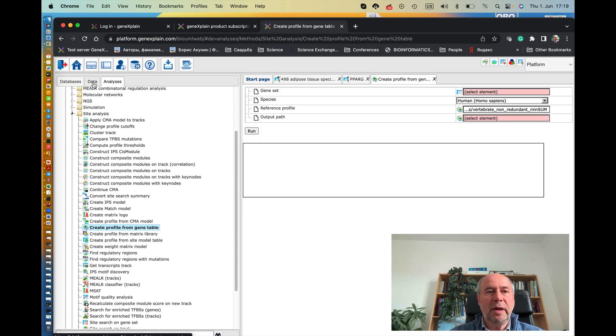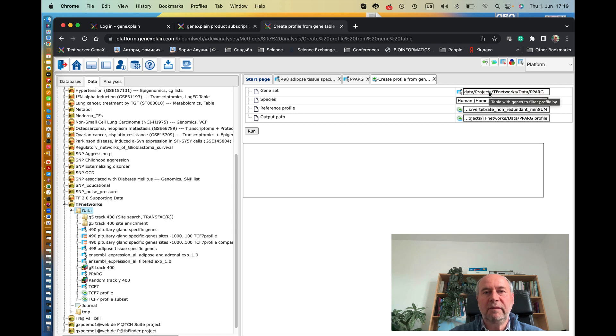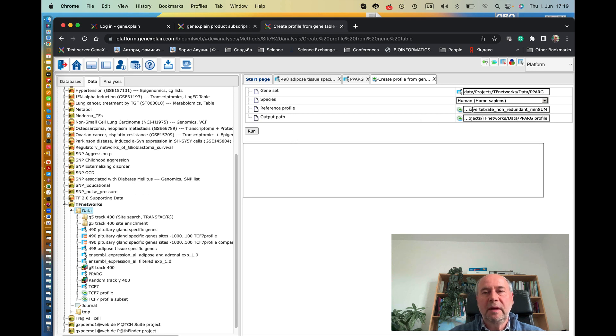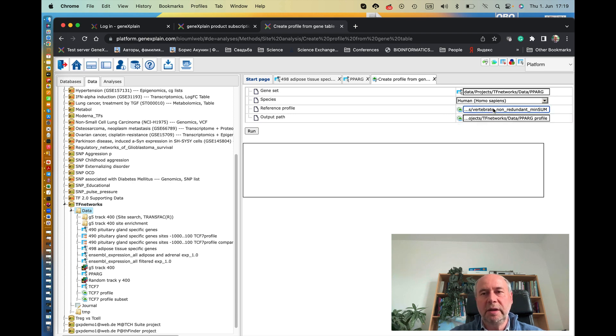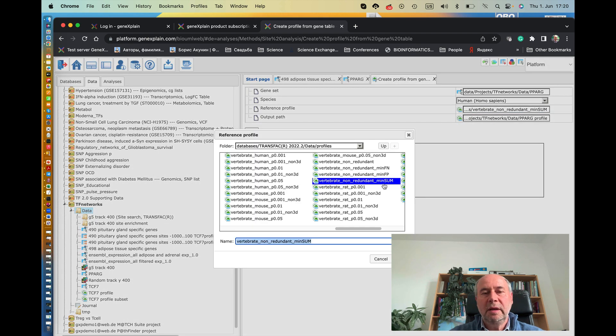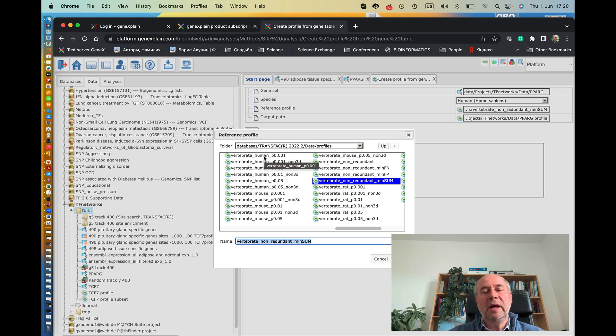We go back to the data and drag and drop this PPAR gamma into this file. And now we have to select the reference profile. So we want to see all the motifs from TransFac. For that we click here and now select the vertebrate human, which means this is a full TransFac profiles for vertebrate factors, factors acting in the vertebrate species.